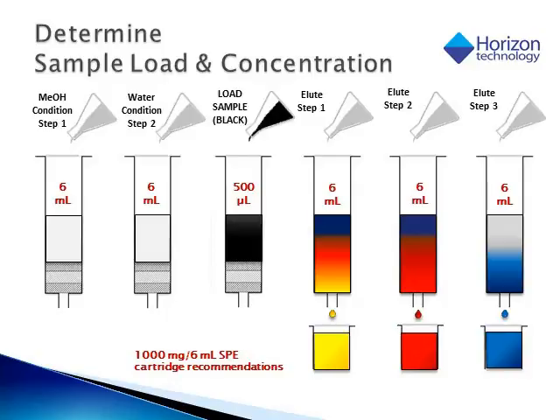When determining the sample load and concentration for your selected cartridge and sorbent weight, it's probably best practice to utilize the recommendations from the column manufacturer. We see here the different series of SPE steps that were used in this particular method development situation.